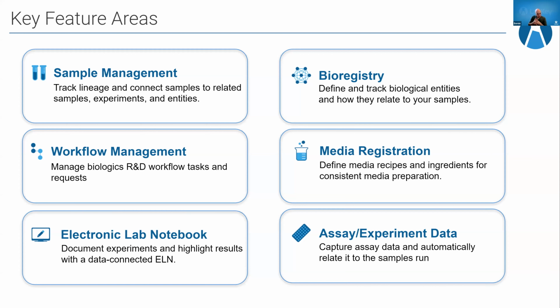Then there is our workflow manager, which helps you create and manage tasks and make requests of each other. Those processes are standardizable and can be built with all kinds of tasks that have comments and files, assay results, sample information, and other metadata. I would say the most common way this is used is for making and managing requests for assays and analyses, but it's used in a variety of other ways as well.